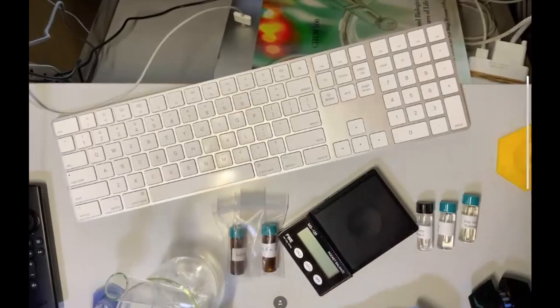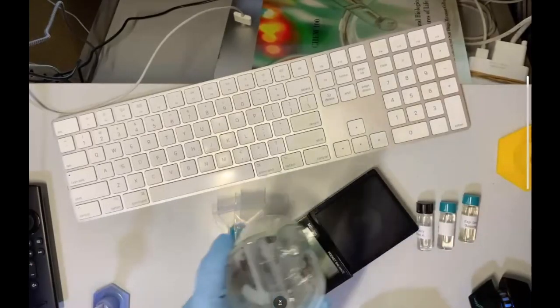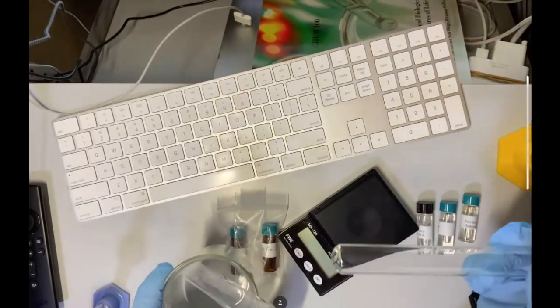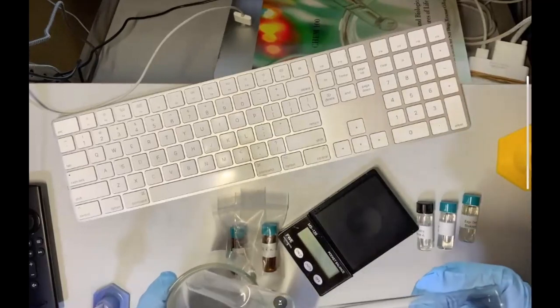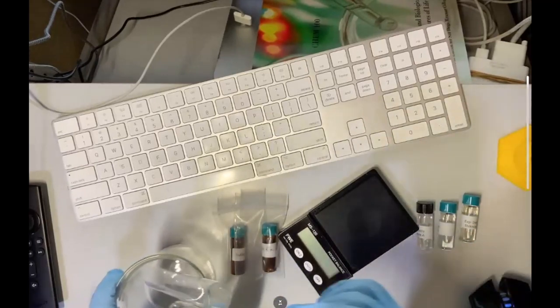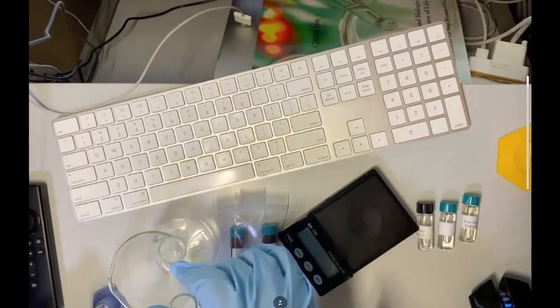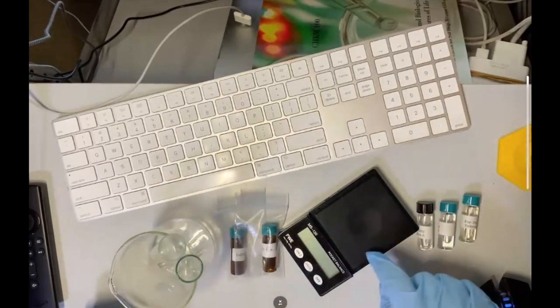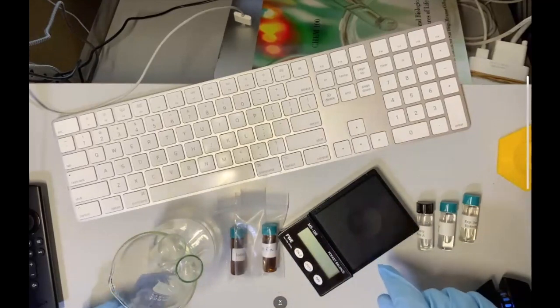Okay, so let me introduce you to the equipment you need. You need some test tubes. I think you have smaller test tubes from KLM, but the lab tech just gave me these. These will work fine. You just need a container. You use your 10 mL graduated cylinder. You have a scale. My scale is different from your scale.